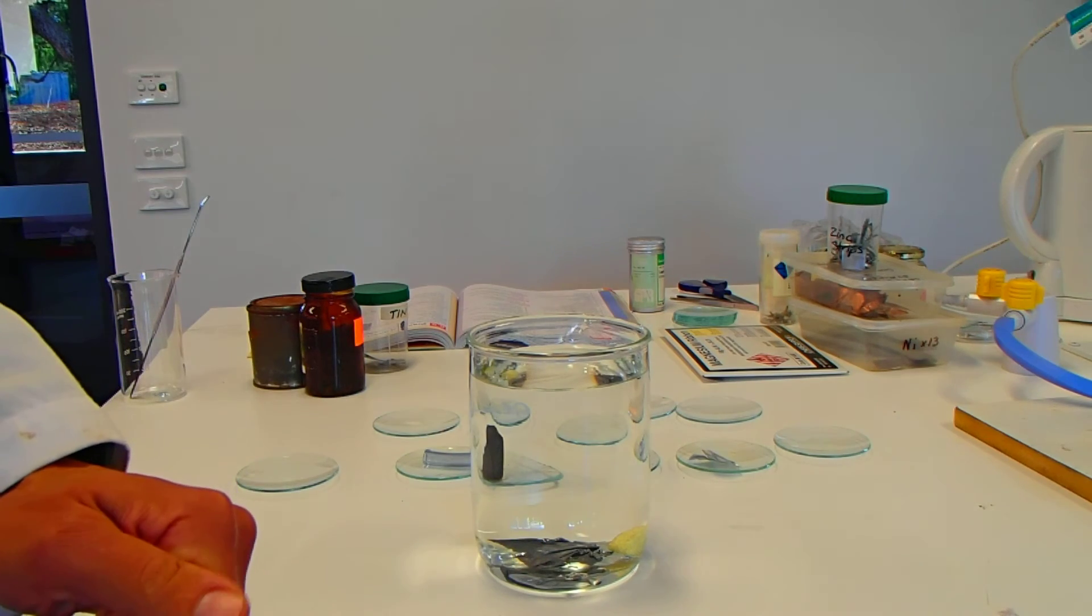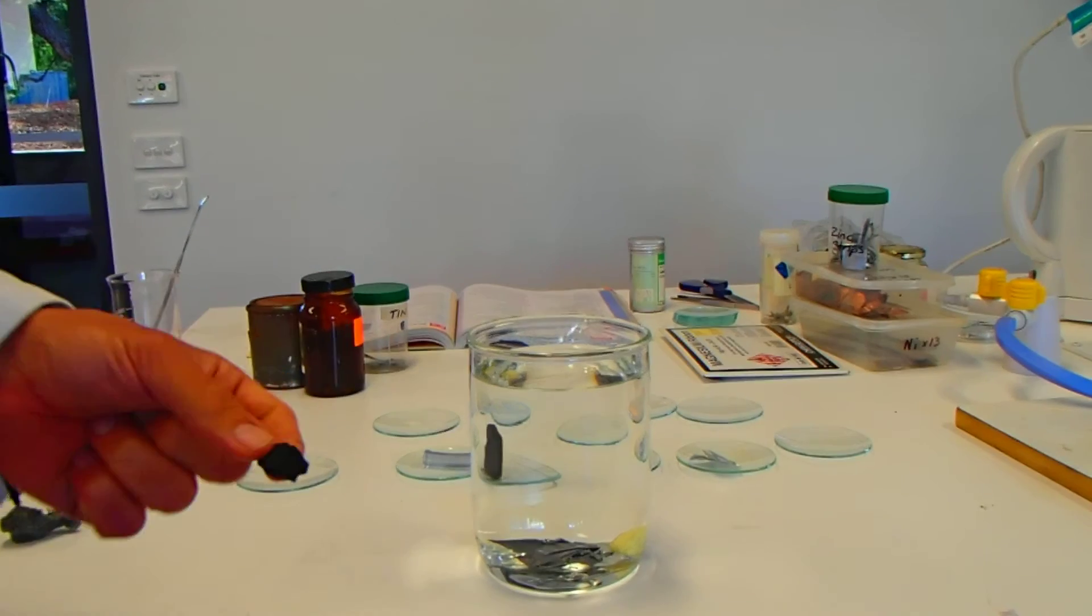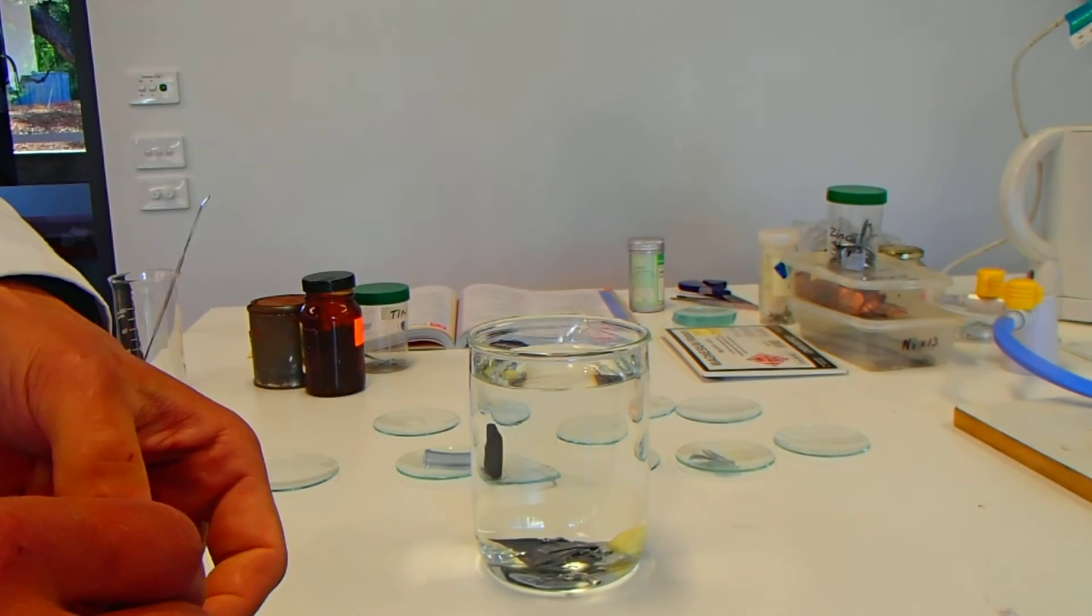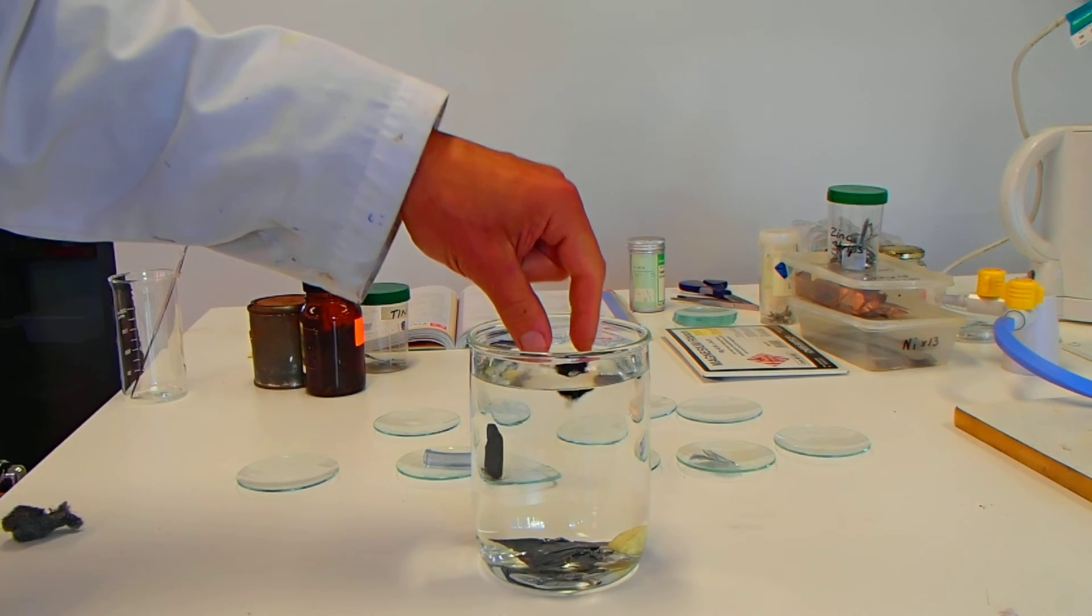But all of those went down that are in there. Let's have a look at the carbon. So, the things that have floated so far: aluminum, silicon and magnesium to a lesser extent. Let's have a see if the carbon floats.